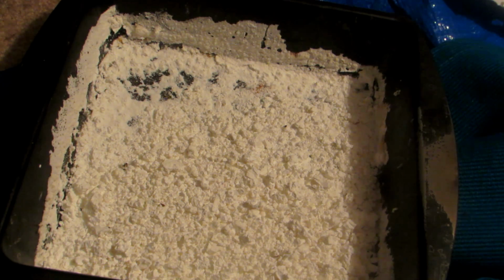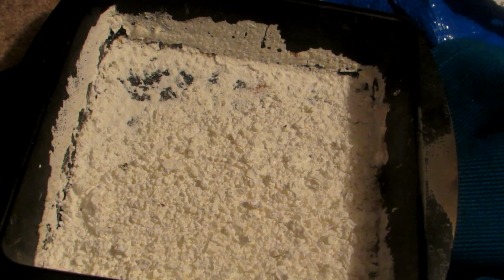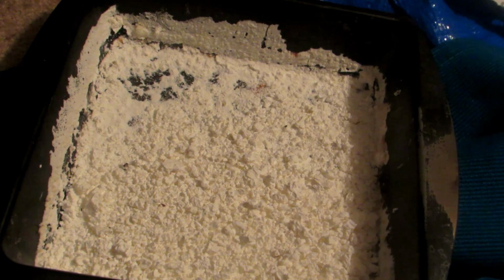So, as I read off the reaction, what we're going to do is transfer this to a blender or something strictly used for science, and grind everything up into a nice fine powder. Then I'll show you what to do next. Okay, so I just put it in this magic bowl and ground it up.